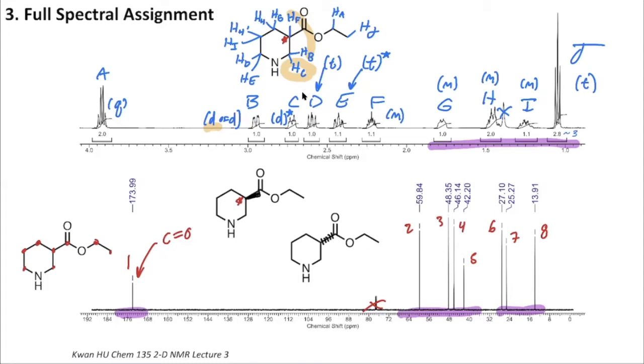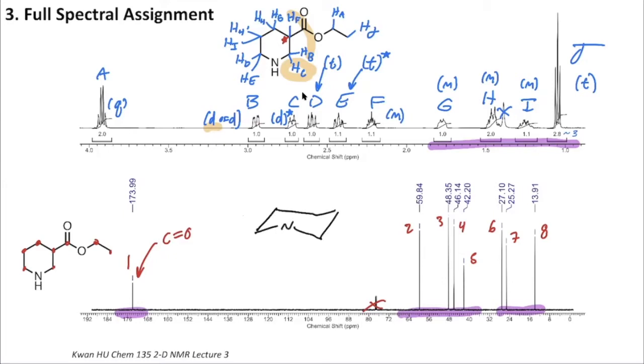Let's remove our stereocenters and think about something else that I'm sure everyone is really happy to see come back, the chair. If I arbitrarily pick one of our isomers of this compound, I'm going to pick the one where HF is sticking up axial and our ethyl ester is pointing down equatorial, and then fill in H, B, and C again randomly, just to illustrate the point that if HF is in this position, it would be relatively locked.